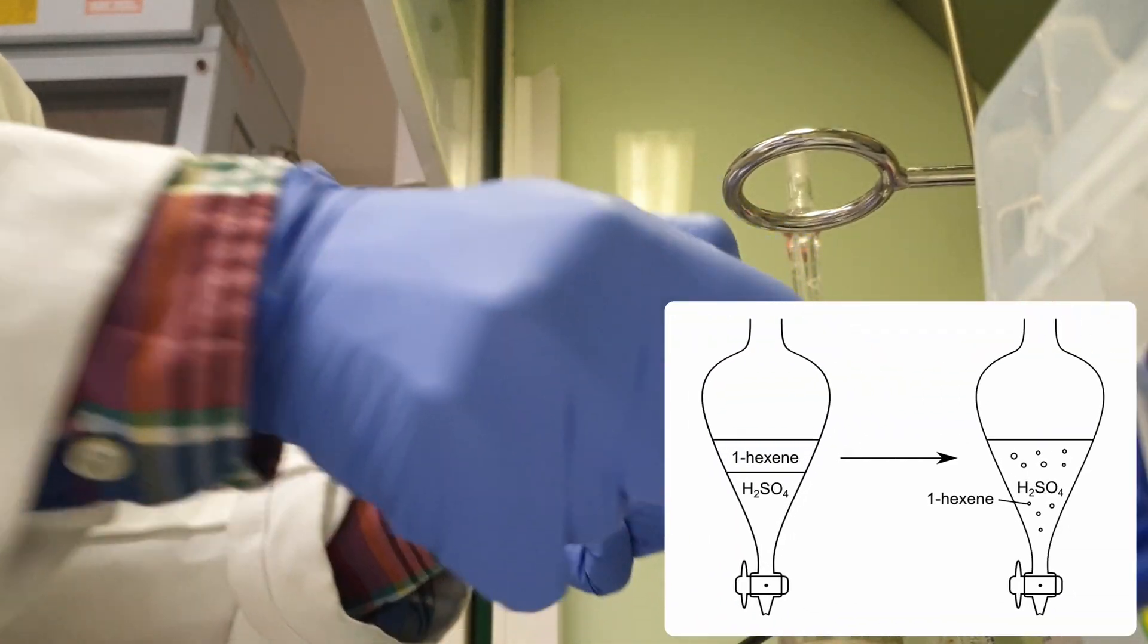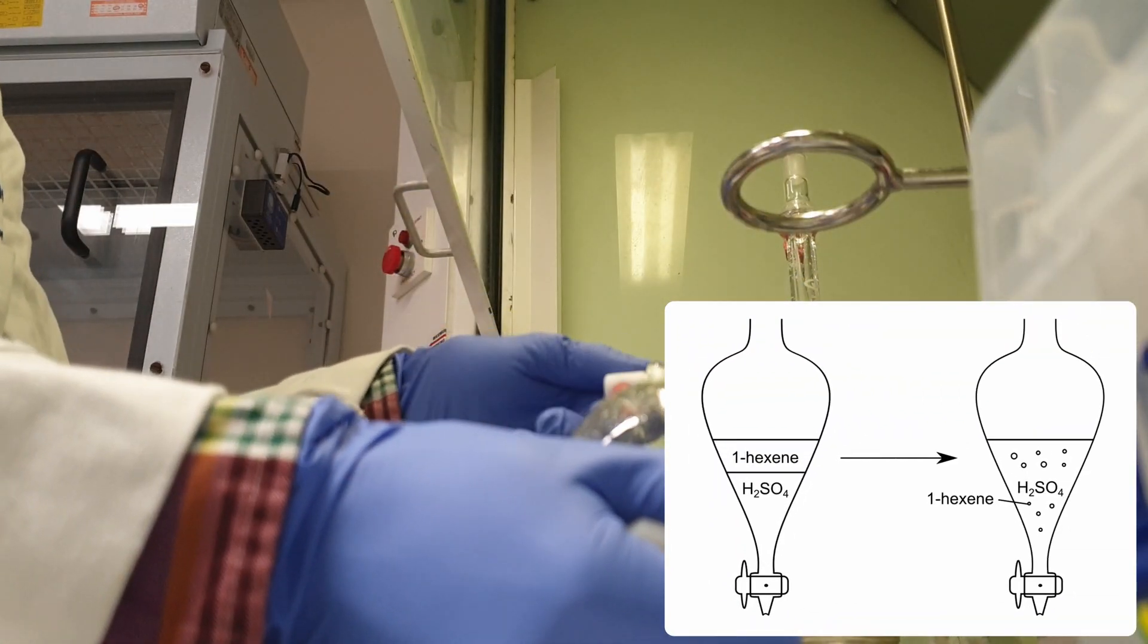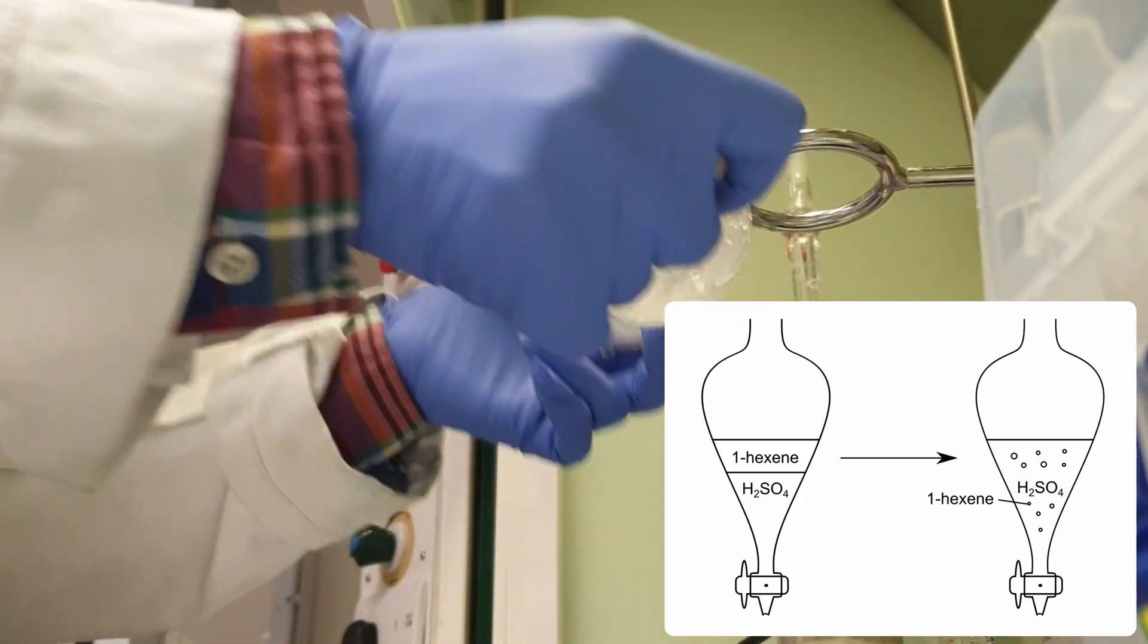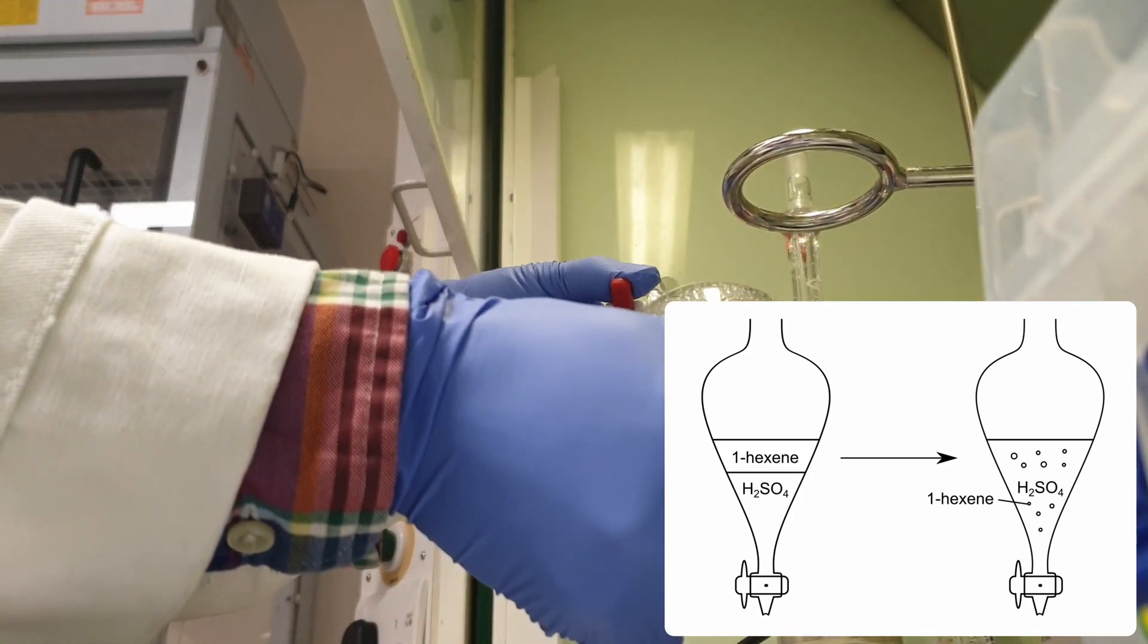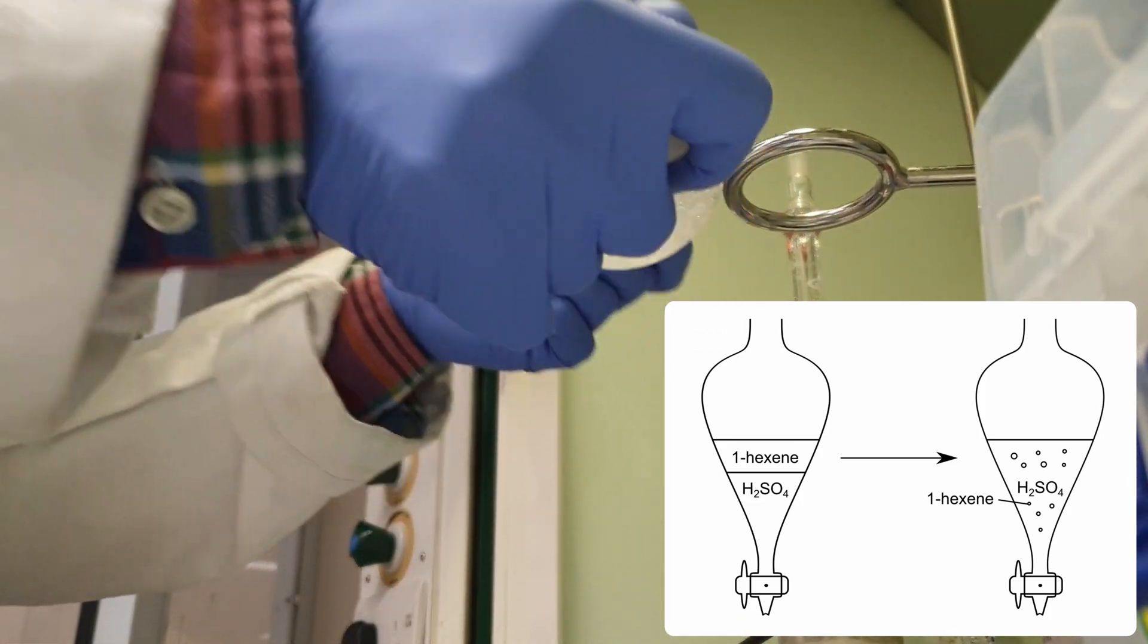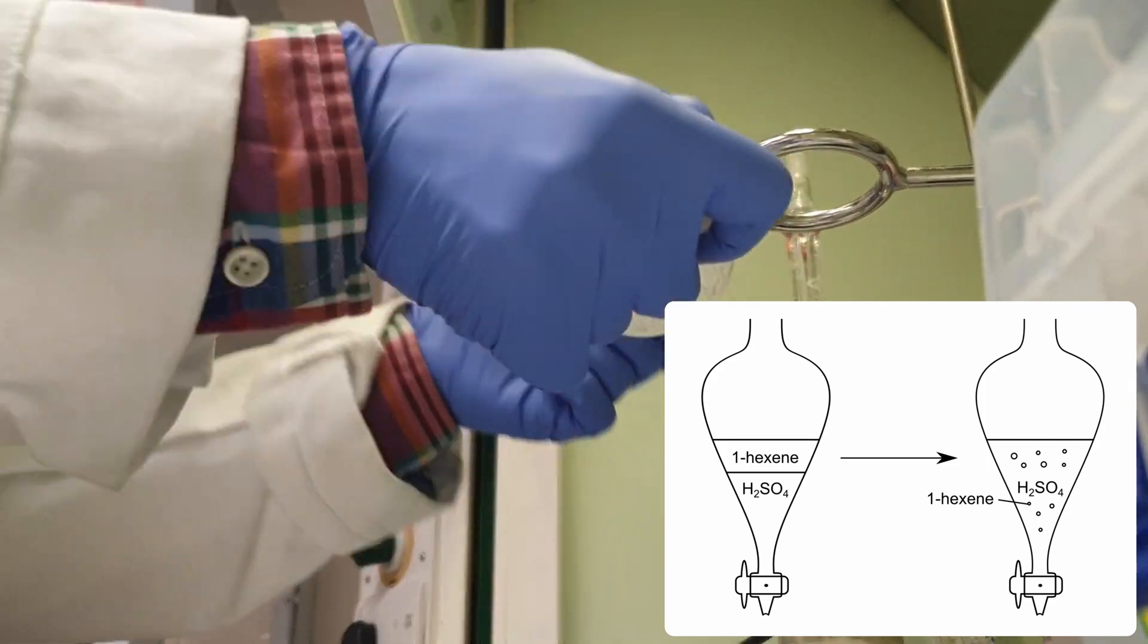In the first step of this reaction I have two layers, a layer of hexene and a layer of sulfuric acid. I'm going to shake them together vigorously with venting to release any buildup of pressure to create a suspension of hexene in sulfuric acid.